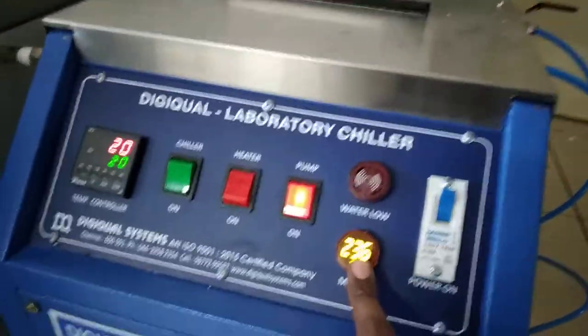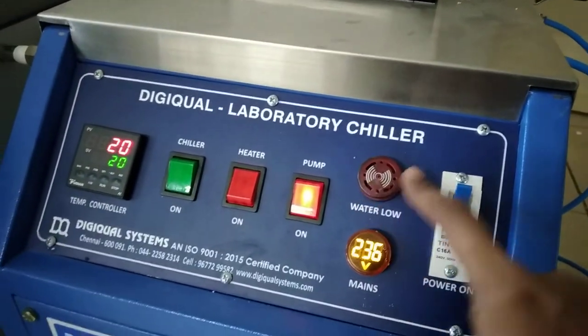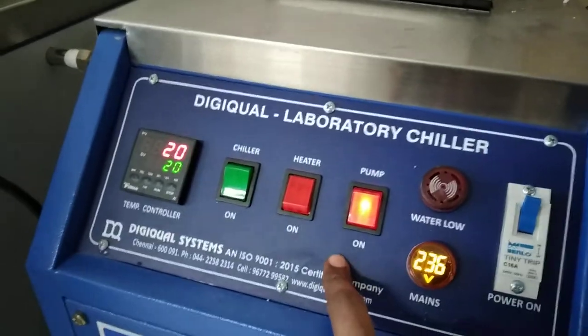This is the incoming power supply. Incoming power supply is 220 volt. When the water level is low, the beep sound will come. This is the water low indicator. Now the pump is on.